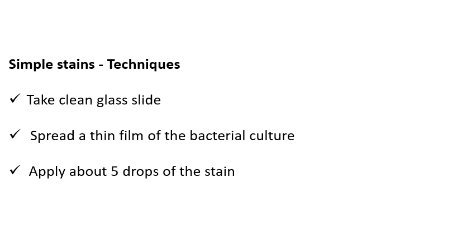We have to take a clean glass slide for this purpose, and we must take a loopful of inoculum, and that inoculum should be spread as a thin film on the slide. After smear preparation, apply about 5 drops of the stain.